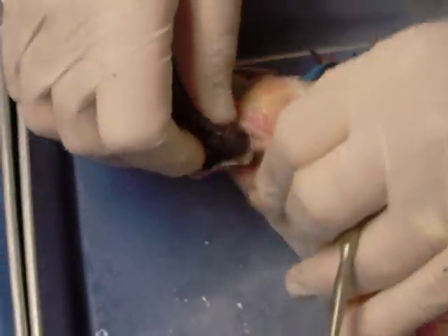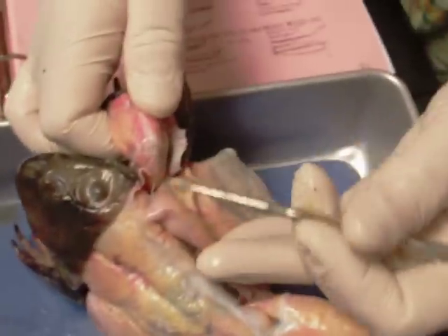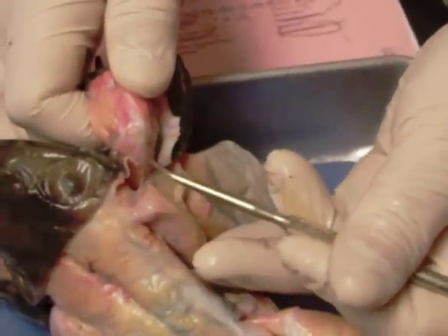Another muscle associated with the frog that we were looking at on these specimens is the triceps brachii, and that is on the back of the humerus, shown right here.